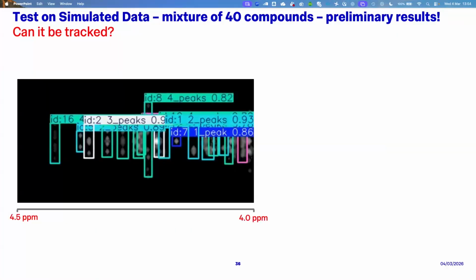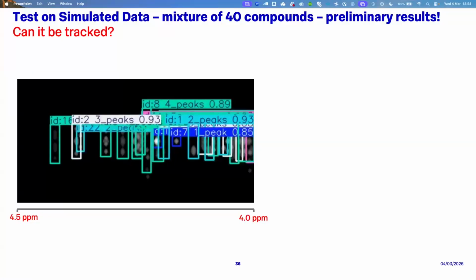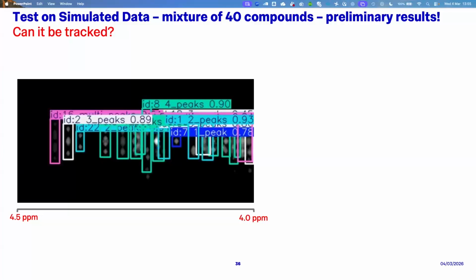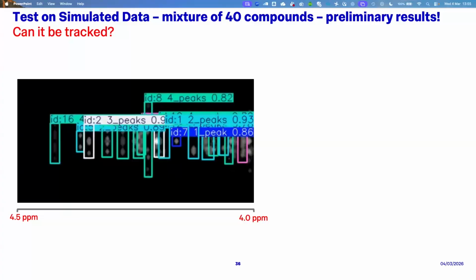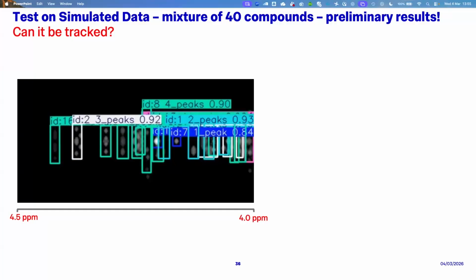And again, here is just, in this case, a video of about 20 simulated NMR samples. And if we just let it run through, I hope it's going to do something. Yes. So it's going through a set of samples one by one. And you can see that if we just take this peak on the left here, it's quite hard to see actually on this projector, but it is being detected. You can see that the color of the detection is changing, which means that it's not always getting exactly the same multiplet type correctly predicted. For the most part, it's okay, but occasionally it gets it wrong.